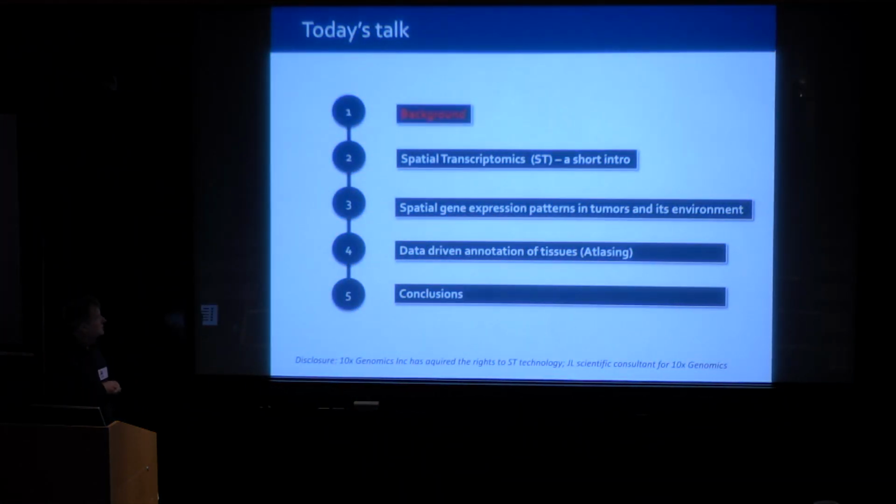So today's talk is focused a little bit on the technology just to get a start. And then I have two vignettes. One is actually on tumors, but I want to discuss a little bit of what we could do there. And then this second vignette would be, can we annotate tissues in a data-driven way? And obviously you're well aware of the Human Cell Atlas, and there's a lot of activity here to also build computational tools to address the Human Cell Atlas initiative.